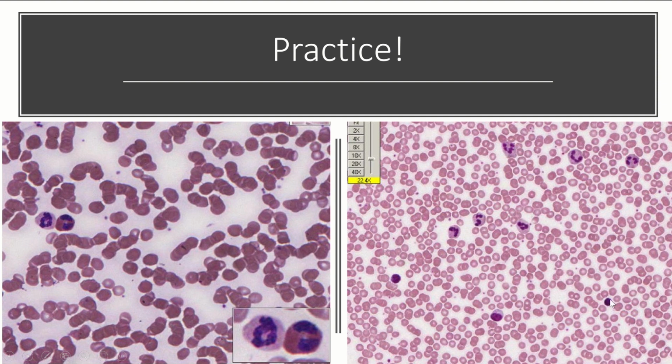Hopefully we can look at these ones and see how in here it looks like the cell is almost entirely that blue kind of nucleus color, right? And so it looks like the cell is just kind of this one constant shade of that dark blue. So this cell is almost entirely made up of its nucleus, right? It's very small. It's smaller than a red blood cell, and it's very uniform. So that's going to be a lymphocyte, okay? This lymphocyte's a little larger than normal, but yeah, we won't get into too much detail on that.